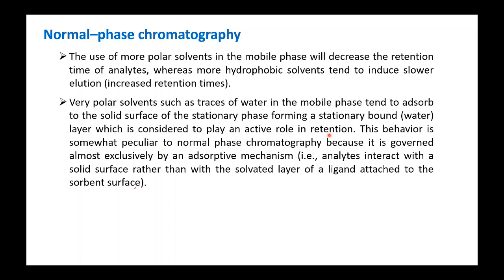That will make different interactions of the compound with the stationary phase. If you have a layer of water on the stationary phase, then the compound is not directly interacting with the stationary phase, so it has the interaction with the water. So that means it will behave differently.